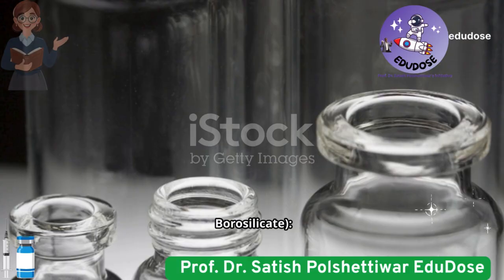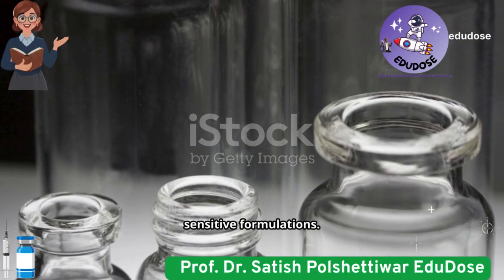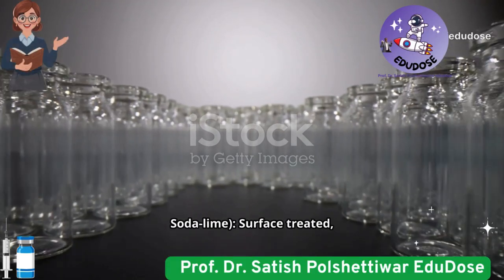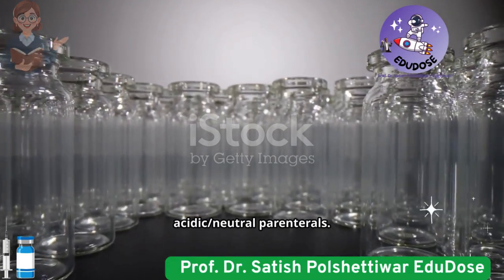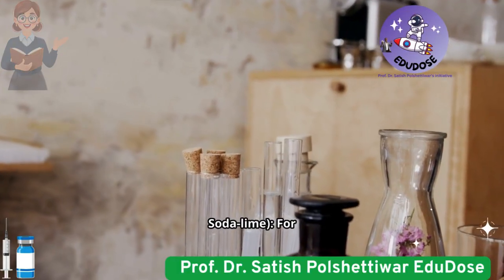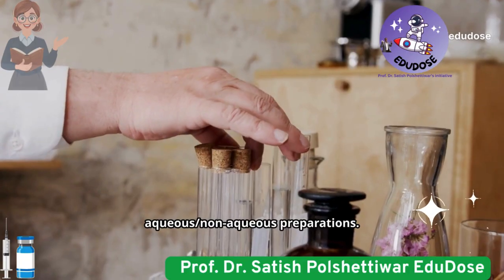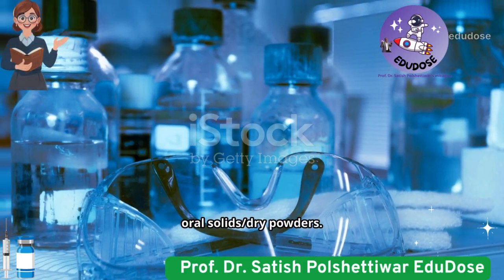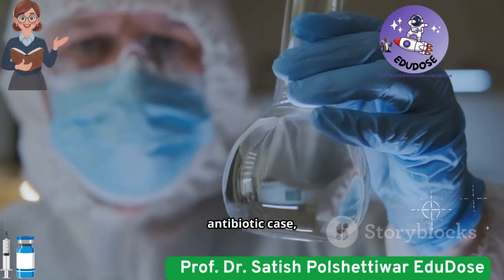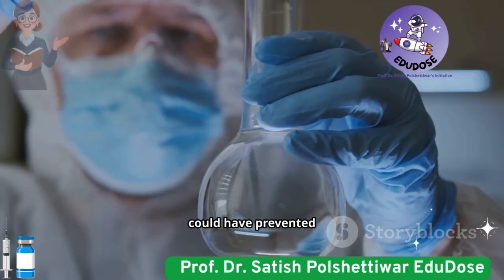Type 1, borosilicate, highly resistant for parenterals, sensitive formulations. Type 2, treated soda lime. Surface treated, suitable for acidic, neutral parenterals. Type 3, regular soda lime, for non-parenteral aqueous/non-aqueous preparations. Type 4, general purpose, mostly for oral solids dry powders. In our earlier antibiotic case, using type 1 instead of type 3 could have prevented the problem.